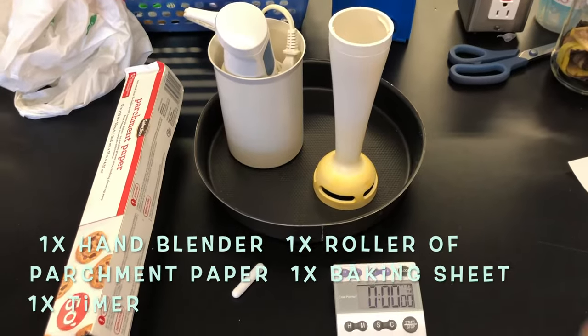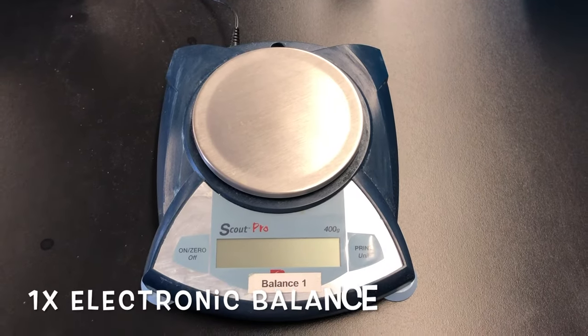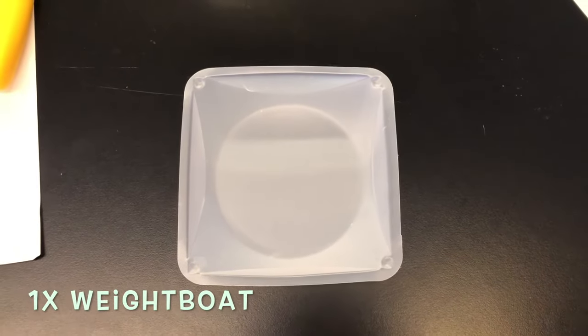You will also need a baking sheet, a magnetic stirrer, and a timer. You'll also need an electronic balance and a weigh boat to weigh the banana peel paste.